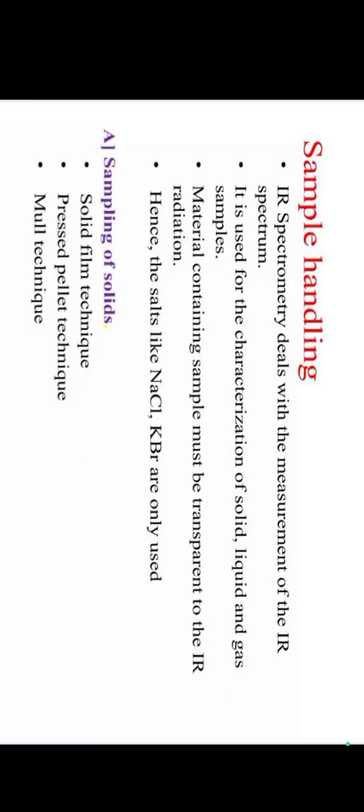Second one, sample handling. IR spectrometry deals with the measurement of the IR spectrum. It is used for characterization of solid, liquid, and gaseous samples. Material containing the sample must be transparent to the IR radiation. Hence salts like sodium chloride (NaCl) and potassium bromide are used in IR spectrometry sample handling.